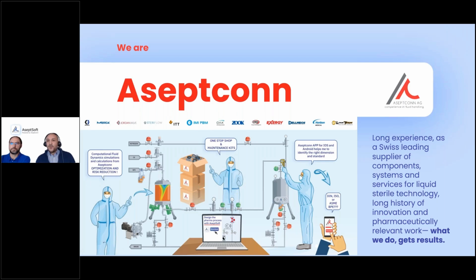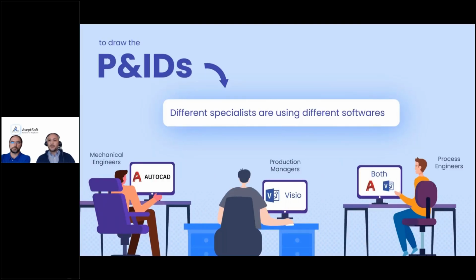CFD, computational fluid dynamic simulation for the liquid sterile technology, primarily used in the pharmaceutical and biopharmaceutical industry. Today, we talk about process design.